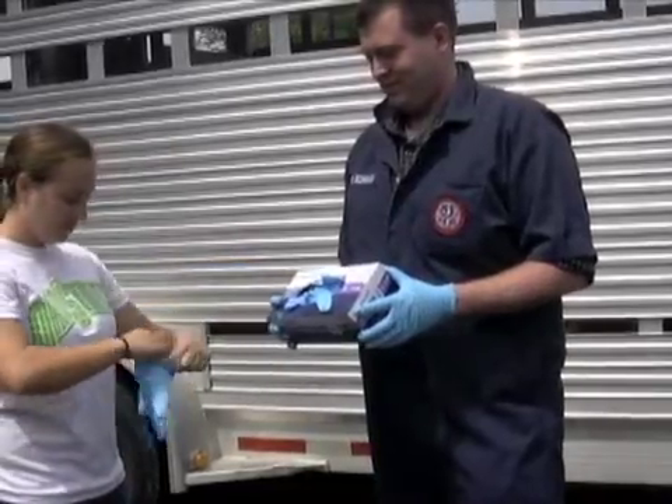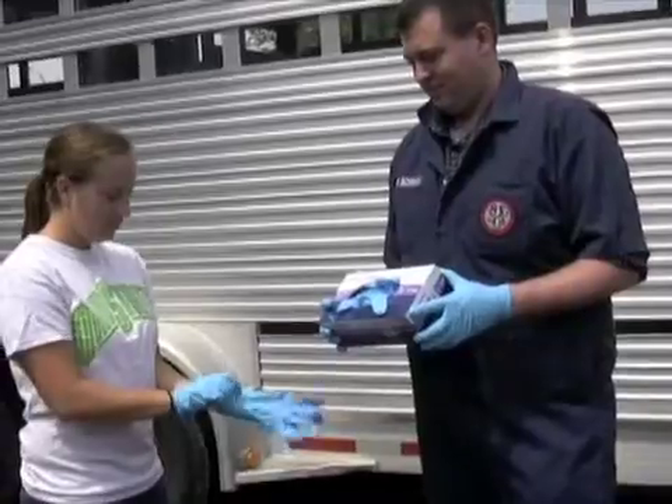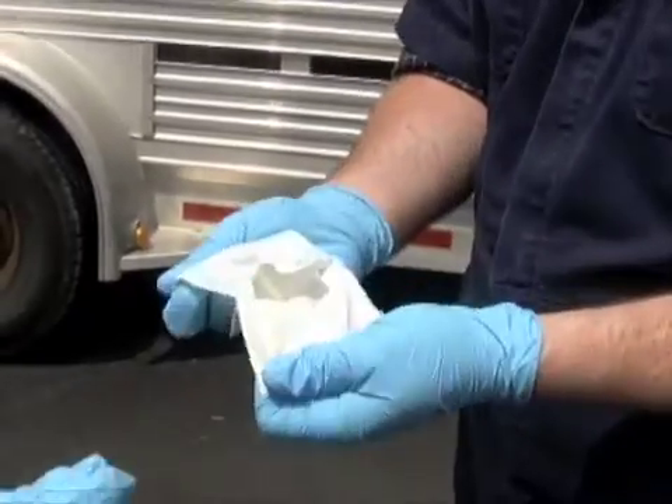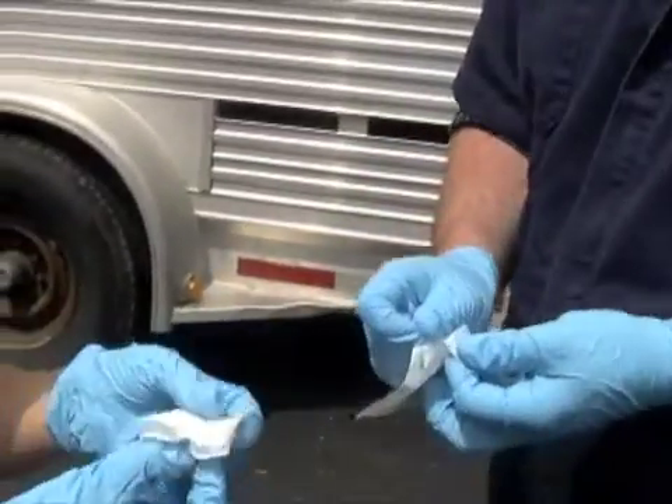Remove two gloves from the box of gloves and put one on each hand. Using your gloved hand, remove one single wipe from the package provided.